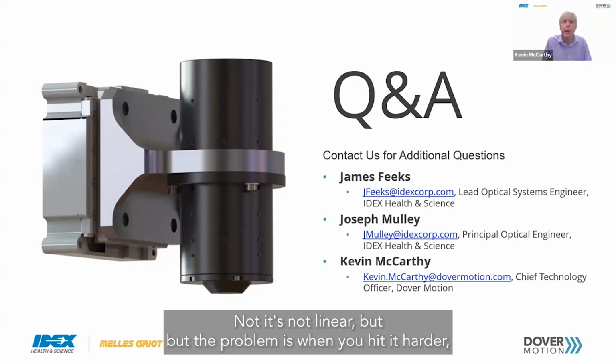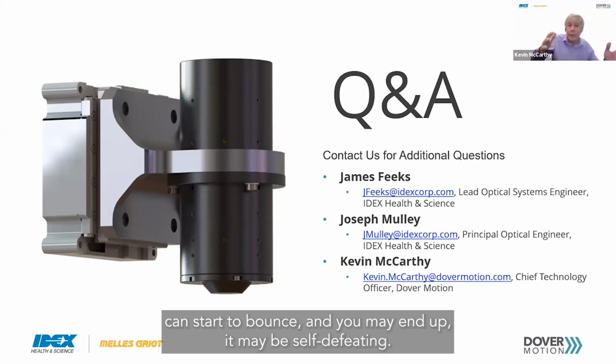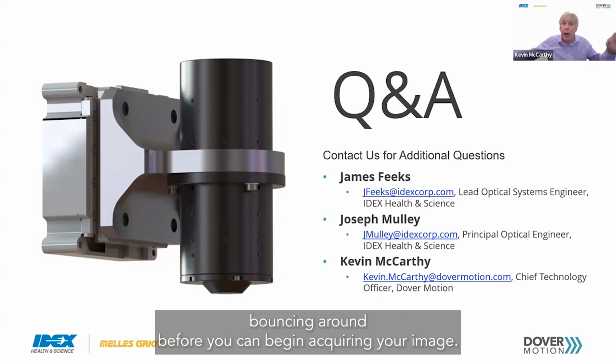It's not linear, but when you hit it harder, the inertial forces go up and the whole thing can start to bounce. It may be self-defeating, and you have to wait until the vibration isolation system stops bouncing around before you can begin acquiring your image.